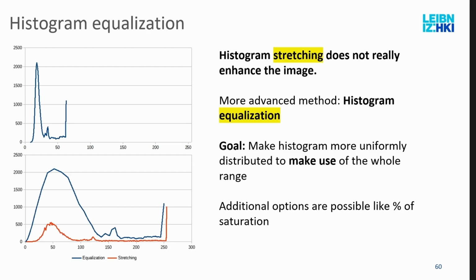But there's a fancier histogram contrast enhancement, and it's called histogram equalization. It's something very different from stretching. Equalization runs some complicated mathematical algorithms that I had to prove once in some image analysis class. I recommend to not try to prove it. It works.